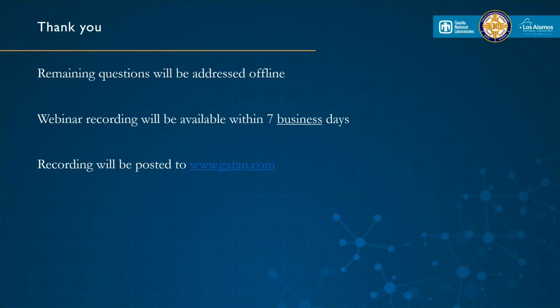So having a nice powerful laptop or a dedicated server is really useful. And then it becomes more a question for the institution, really, and how do you deal with that type of data. Because of the nature of our host labs, we're all hard drives, but if there are high-speed data links and things like that, then obviously that makes things a little easier.